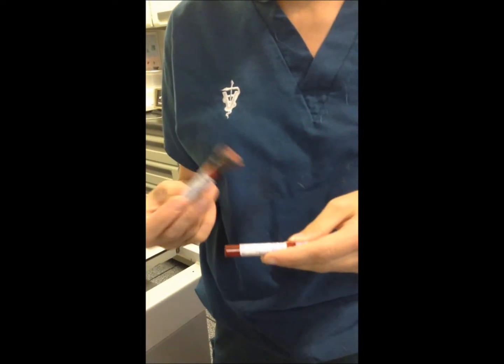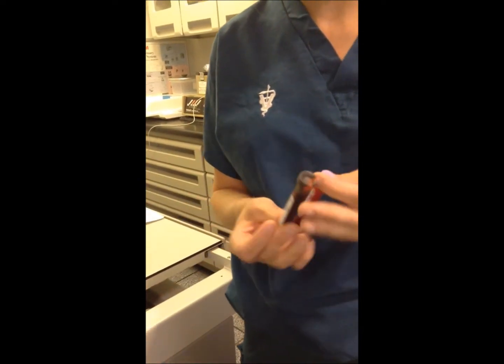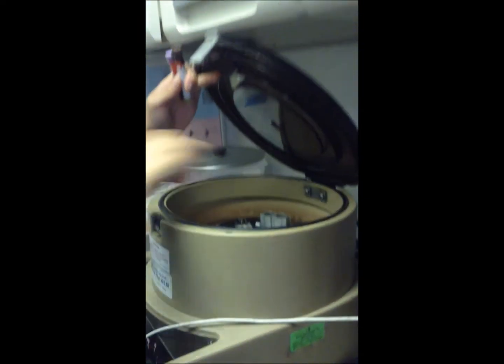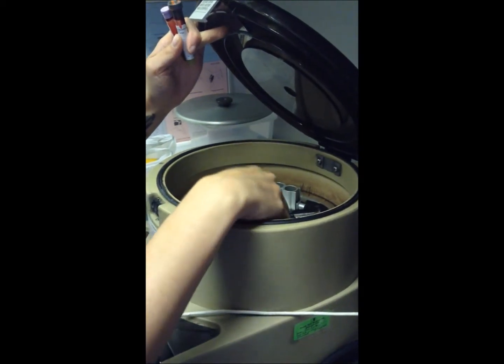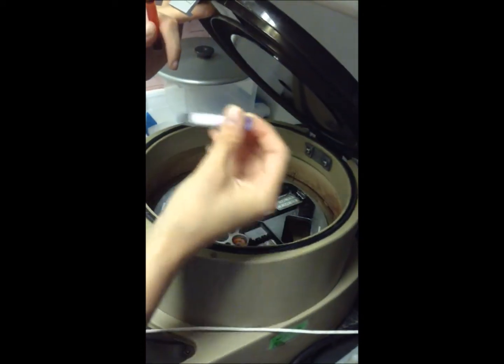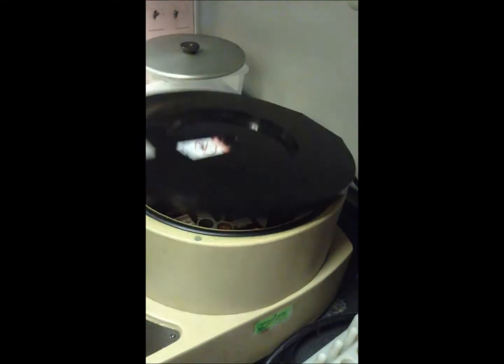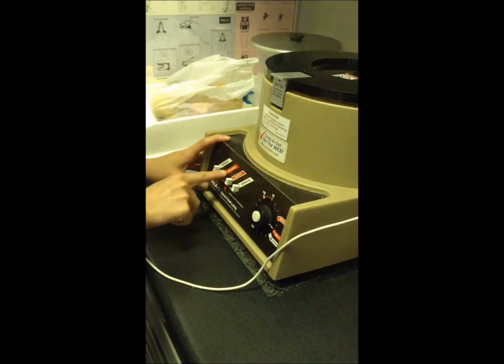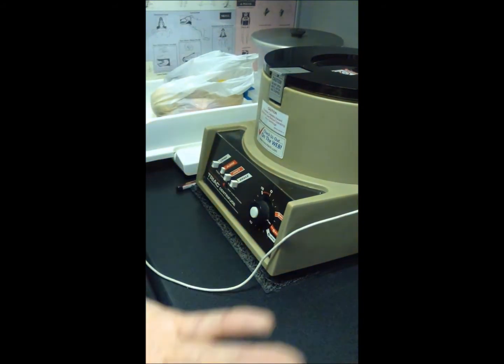Ruby's the donor. So the serum separator, you have to allow to clot before you spin it down. So the blood's completely clotted right now. So we're going to put both of these samples into the centrifuge and spin them down. So when you put things into the centrifuge, you always have to balance them out. So we have a serum separator filled with water, and we're going to stick it in this side. And then we're going to stick the serum separator with the blood on this side. And then same thing with the lavender. We have a lavender filled with water. You put that on that side, and we'll put the lavender on this side. And you close it tightly, and you're going to spin it down, press the blood button, and it spins for 5 minutes. Press start, and it spins.